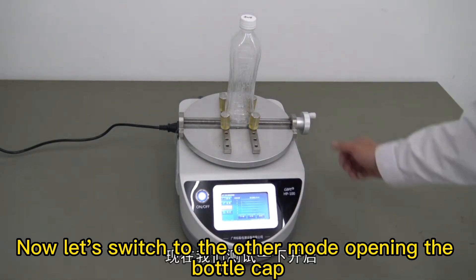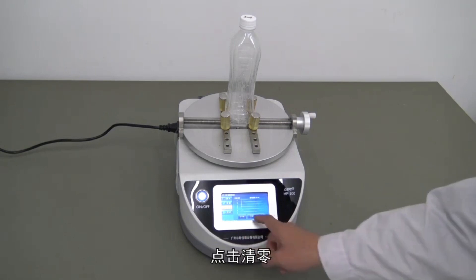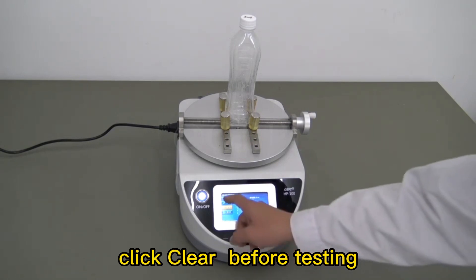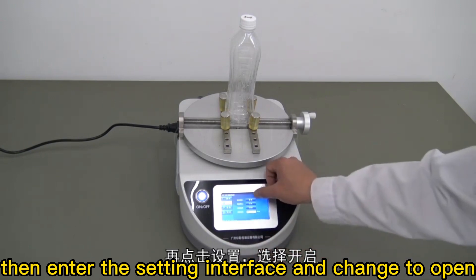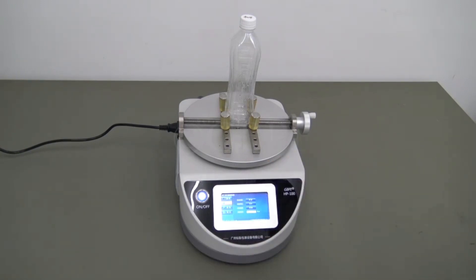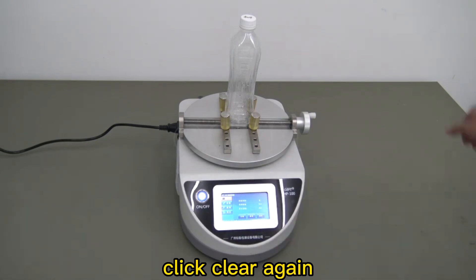Now let's switch to the other mode: open the bottle cap. Click clear before testing, then enter the setting interface and change to open. Back to the test interface and click clear again.